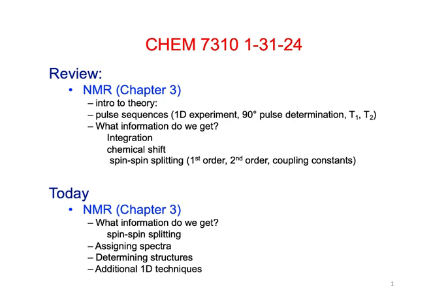All right, so today we're just going to continue on with our discussion of NMR. We are going to talk a little bit more about splitting. We're going to look at some more or less first order splitting patterns, complex splitting, and try to analyze how they would arise.